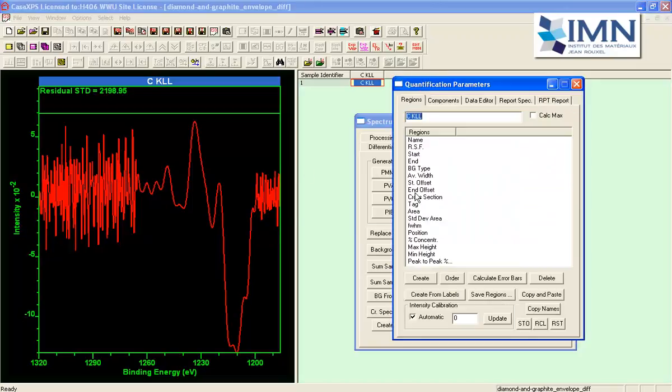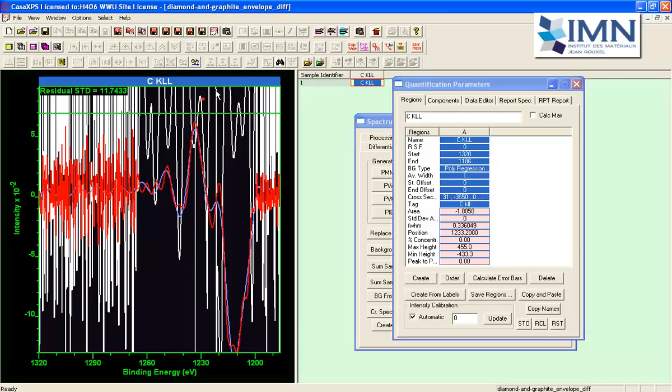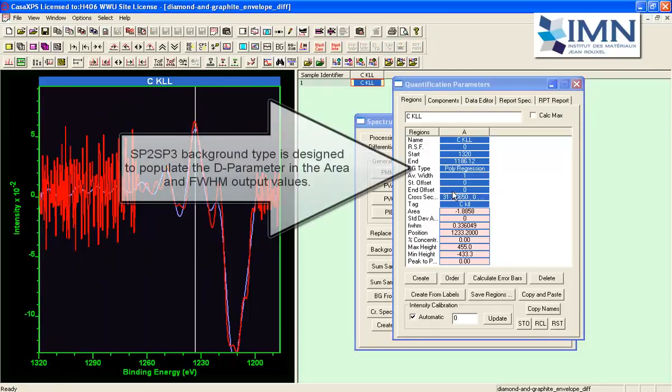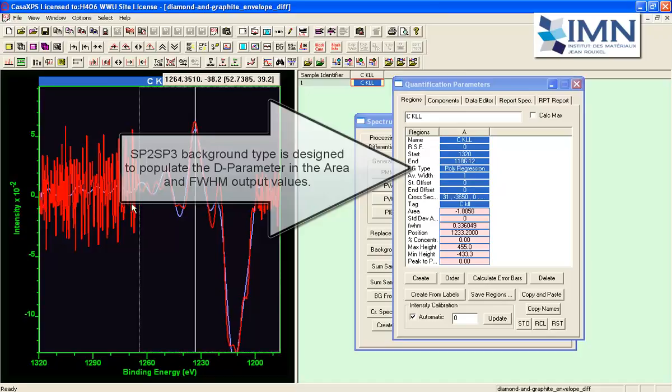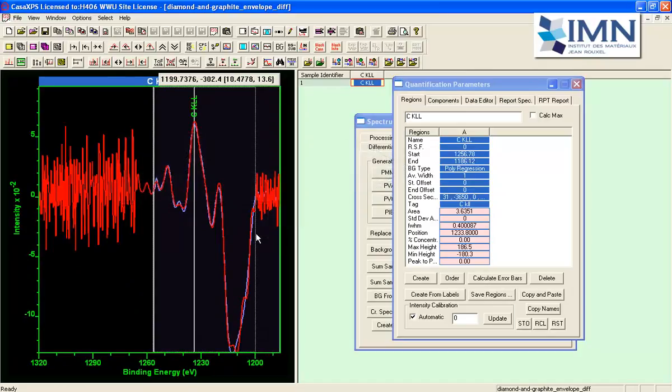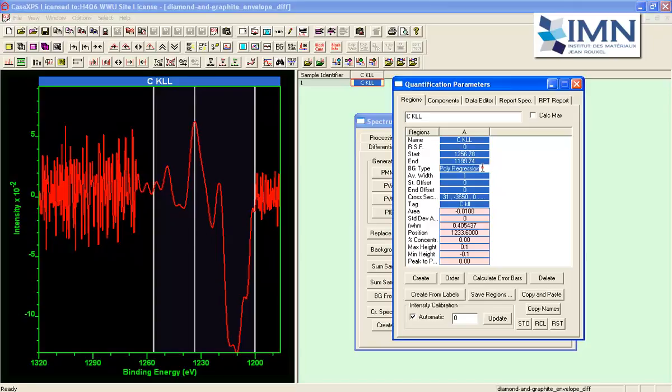And what we can do is create a background type here let's just turn off the residual and adjust the region limits so that it targets the data that have been differentiated nicely and then we will use the SP background type.